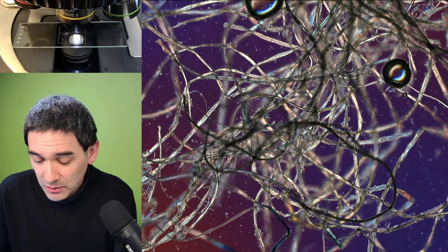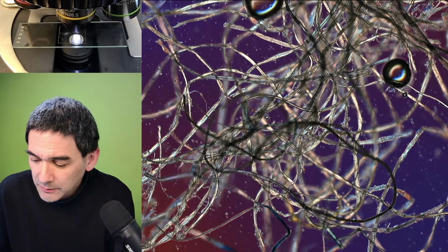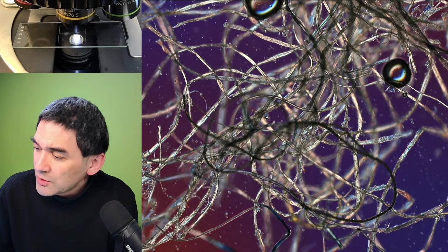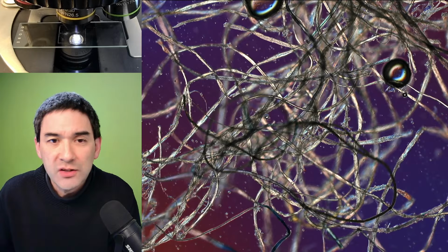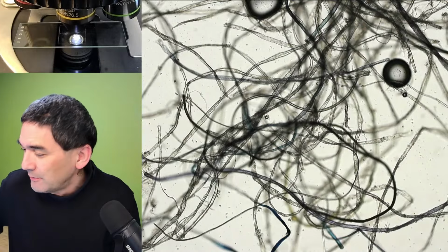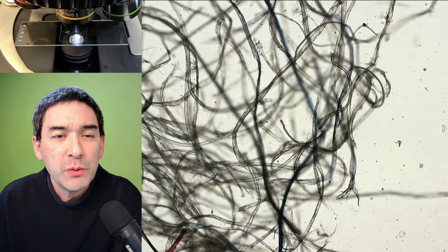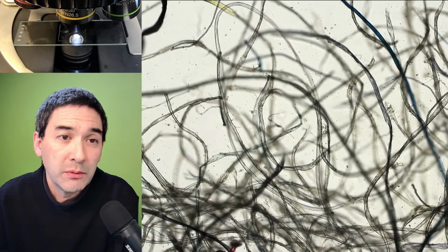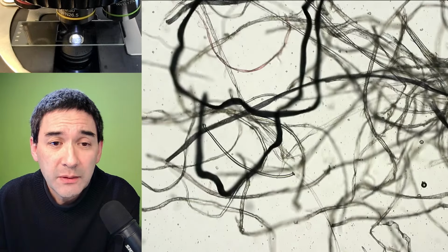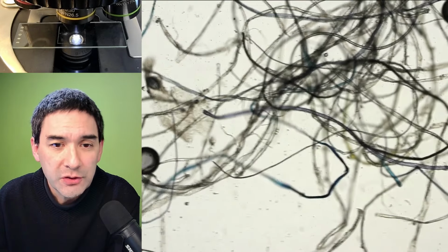So that's the idea of today. What I also want to do is show you some different imaging techniques. This one is now DIC. In bright field, it looks a little less exciting, maybe less colorful. However, bright field has the advantage that you're able to see the natural colors of the fibers much better, because some of them are actually stained and colored, and this can be seen much better when you're looking at it without any filters.